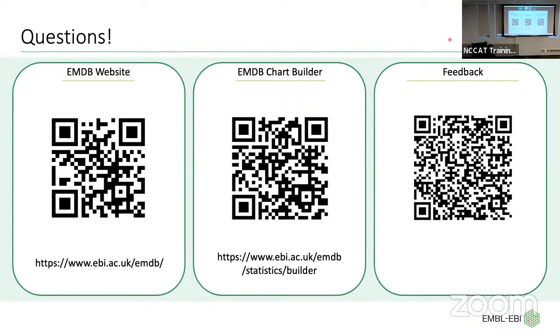Hey Jack, nice talk. I just want to build on the last question, because especially for EMDB, there are more and more newcomers in the EM field, and some of the metadata we actually don't know what they are. We really don't need to know. For example, to this day, I don't know what an assembly is in EMDB. Every time we deposit, we get away with it by either leaving it blank or selecting whichever option allows us to keep advancing, and then eventually it uploads, and whoever downloads thinks our data is okay.